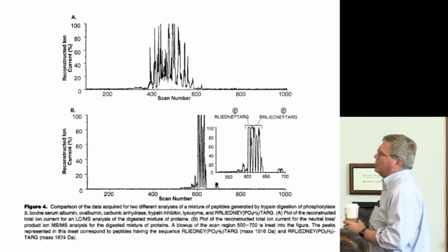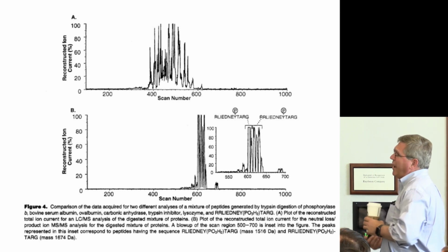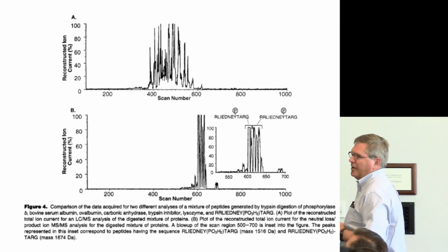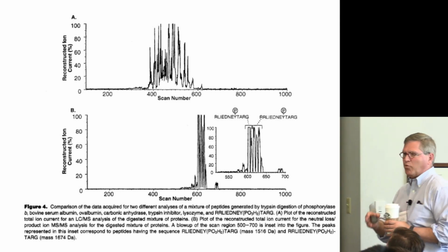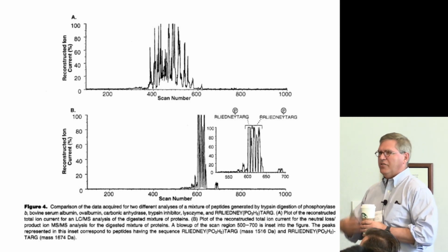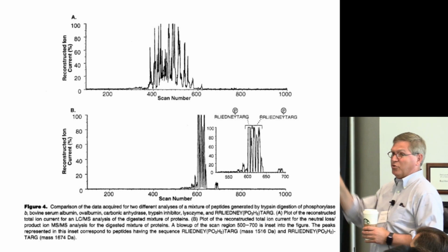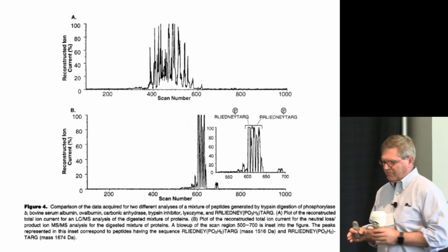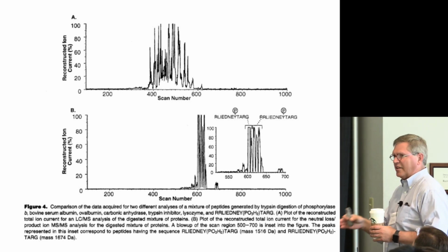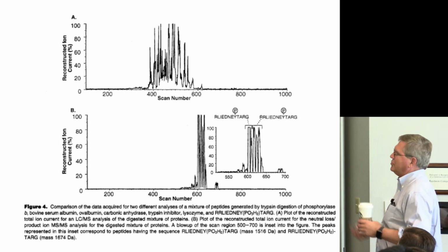So the other lesson I learned is not to listen to people too carefully, because I asked engineers at Finnigan, and the instruments back then had this thing called instrument control language, where you could write programs to direct the mass spectrometer to do things. I mean, all that's done for you now. But back then, we used to be able to do it ourselves, and it was fantastic because you could innovate. And so I asked one of the engineers at Finnigan, could I write a program to automatically collect tandem mass spectra? He said, no, that won't work. And so I listened to him, so I didn't do it.